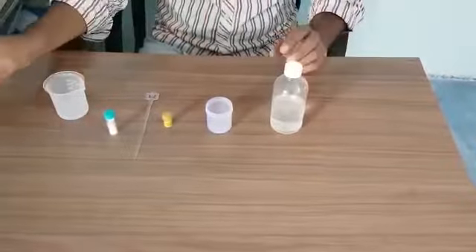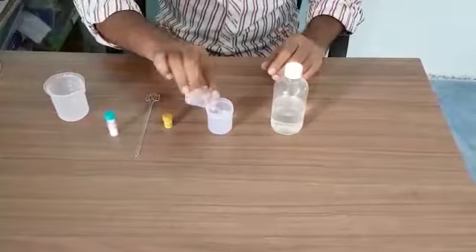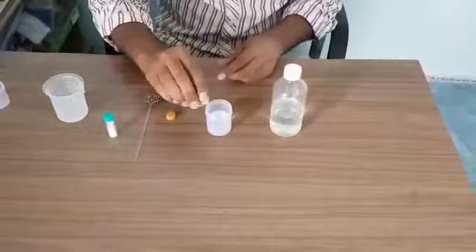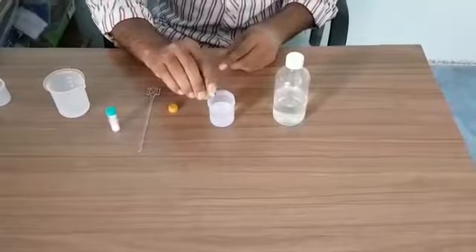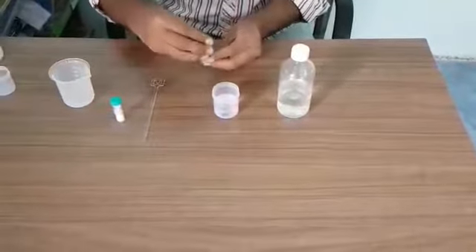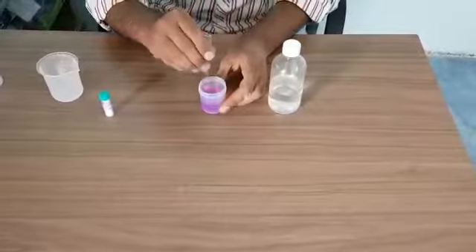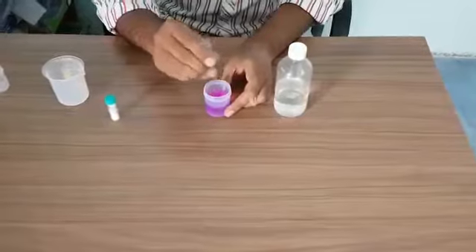Then take water again into the container. We have to add potassium permanganate — again, 2 to 3 flakes of potassium permanganate into this. And then we will stir this solution with the spatula.